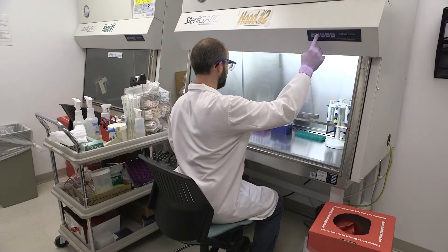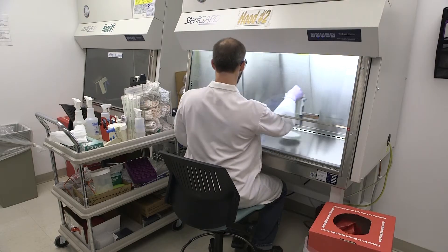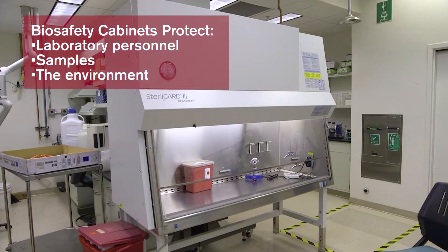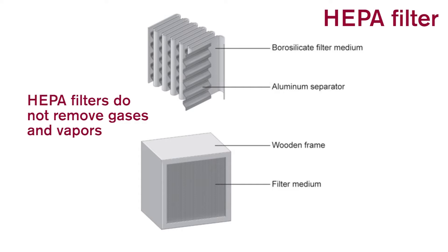Biosafety cabinets are the primary means of containment developed for working safely with infectious microorganisms. They are designed to provide protection to laboratory personnel, the samples they are working with, and the environment when appropriate practices and procedures are followed. The HEPA filters will provide a sterile environment by removing at least 99.97% of particulates at 0.3 microns. HEPA filters do not remove gases and vapors.